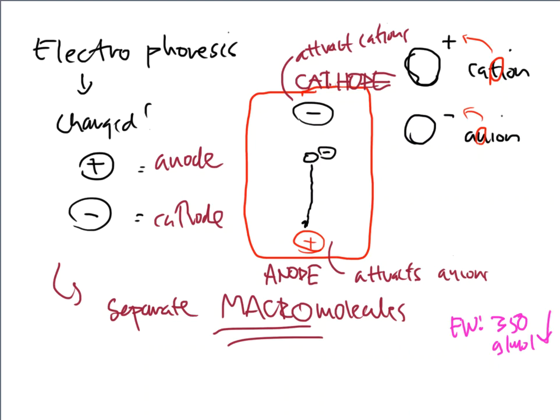Well, electrophoresis is going to help me. What goes on here is that this electrophoresis method is built to separate macromolecules. What that means is that I'm going to have really big chunks and maybe some smaller chunks, but still pretty large, and then maybe some really big chunks of stuff. These chunks are extremely large, very difficult to work with under normal circumstances, meaning that normal separation here is not going to help us out too well.